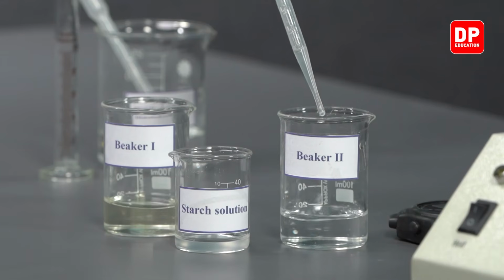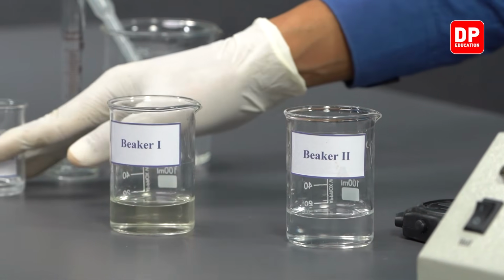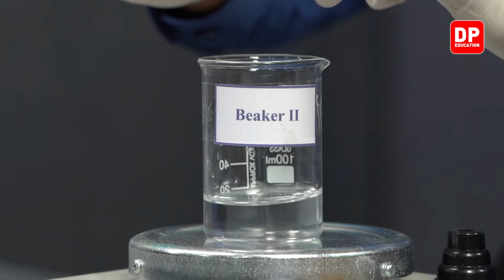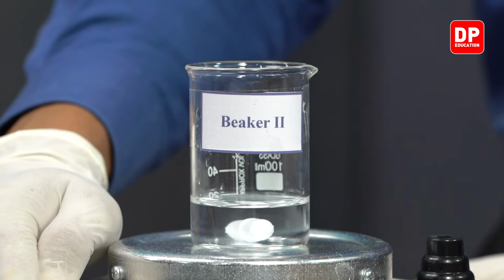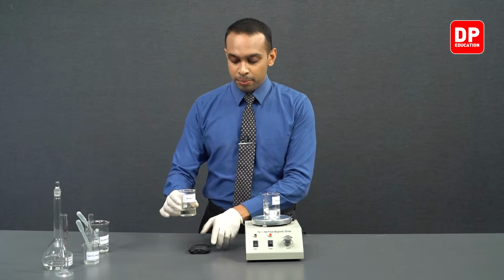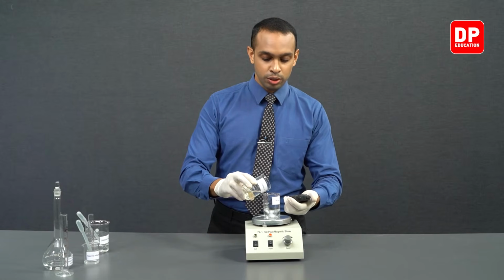We'll add 5 drops of starch solution into the beaker, and then we can place it on our magnetic stirrer, and we can start the magnetic stirrer like so. Now it is time for us to add our Fe3 plus aqueous ion solution. So as we add Fe3 plus, we will be starting our stopwatch.